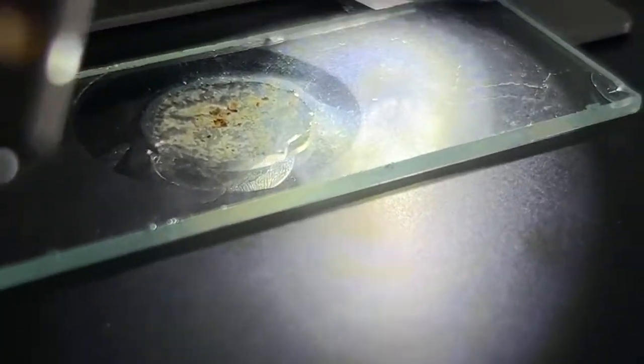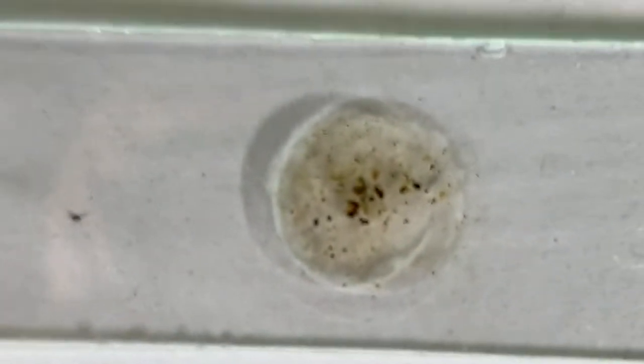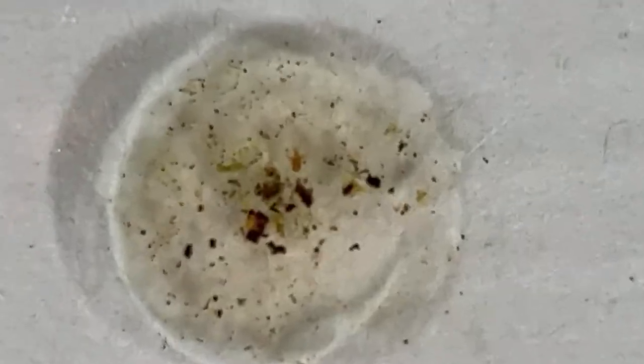So all that interplay was happening in this little bit of water. And let me take out the slide and see if we can make out that little tick here. There is the tick. Okay, let me stabilize my hands a little. It's very difficult.